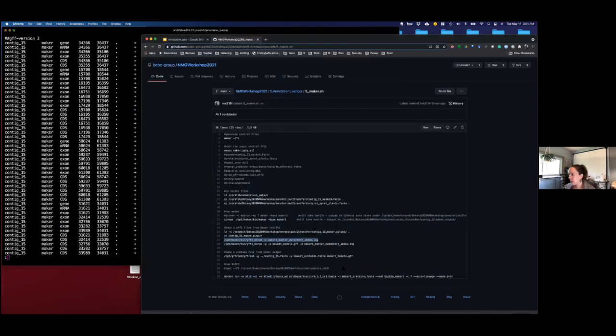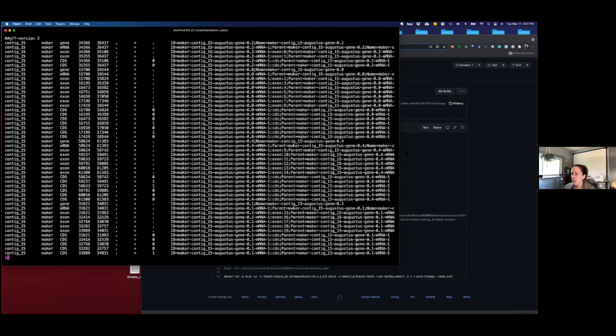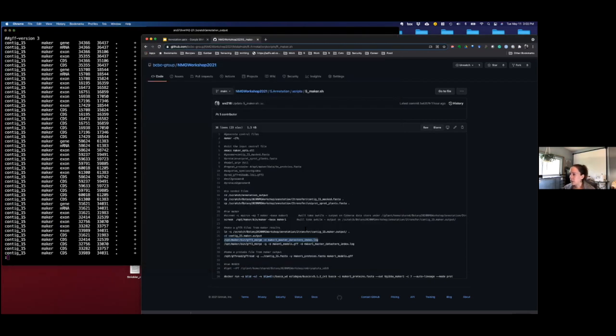And then the last thing you'd want to do once you have this, so let's look at the command again. You can use GFFread again with your GFF3 file and the genome file to get a protein FASTA file, and then you can run BUSCO on that. That would be the command down here if you wanted to do that. And that will give you an idea of how good you are able to actually annotate genes.